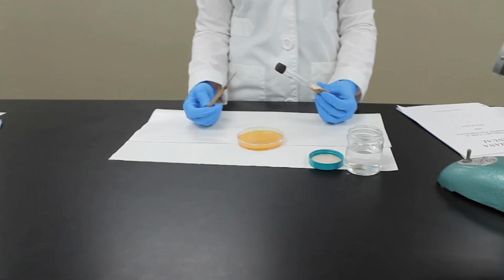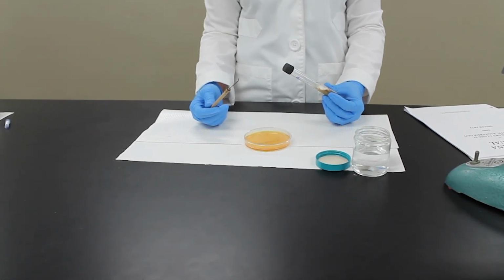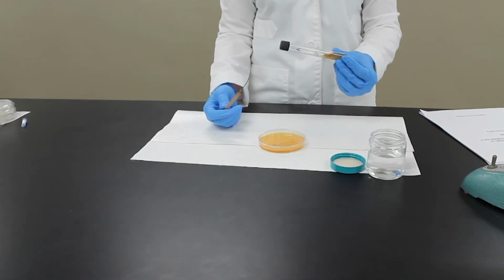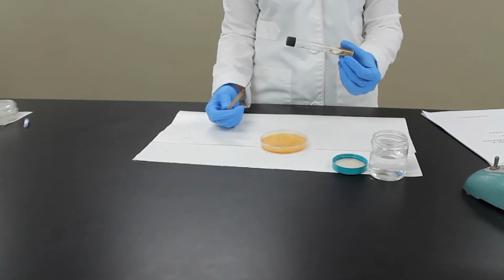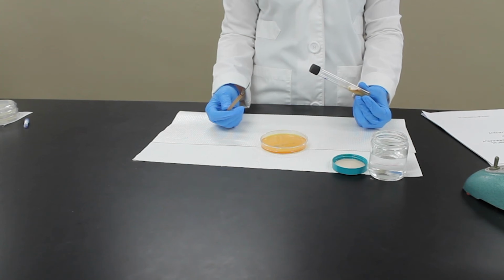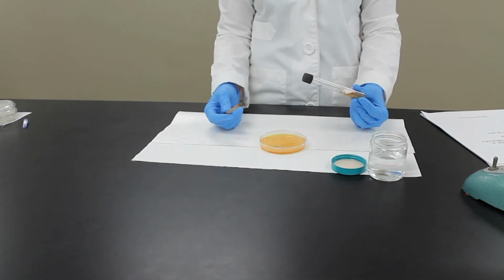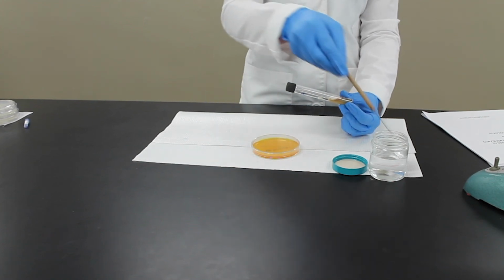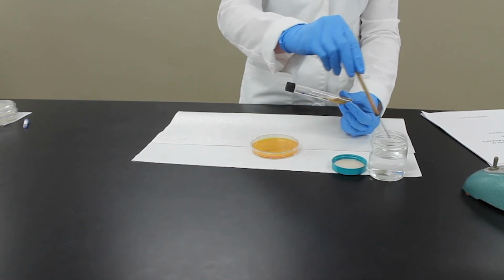So for inoculation of DTM agar, we're going to be going into a tube that contains a culture of fungi here, and Kim will be picking up a little tiny amount of that on her probe that she sterilized, and then that'll be placed right in the center of the plate.